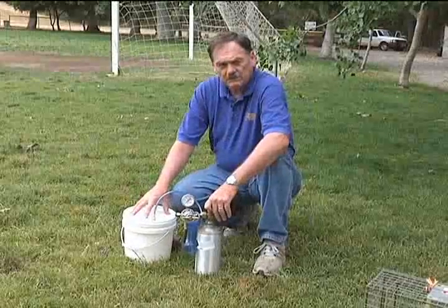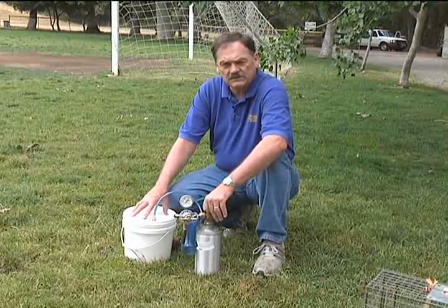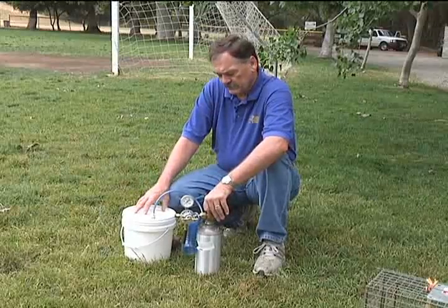We've made a chamber here just with a plastic bucket, but you can use this depending on the size of your trap. It could be as big as a trash can for a large trap, or even smaller than this if it was a small type of trap.